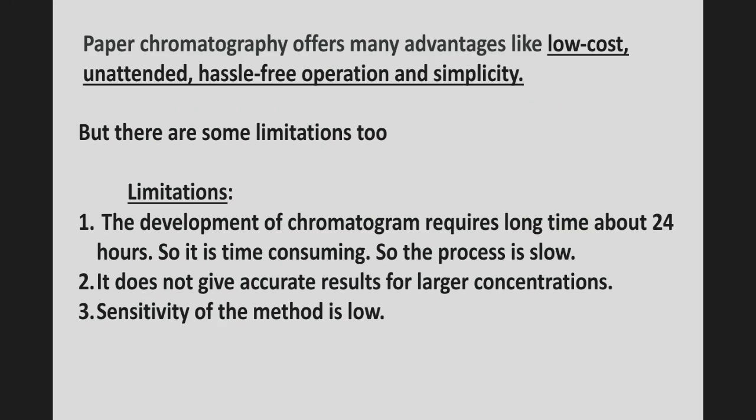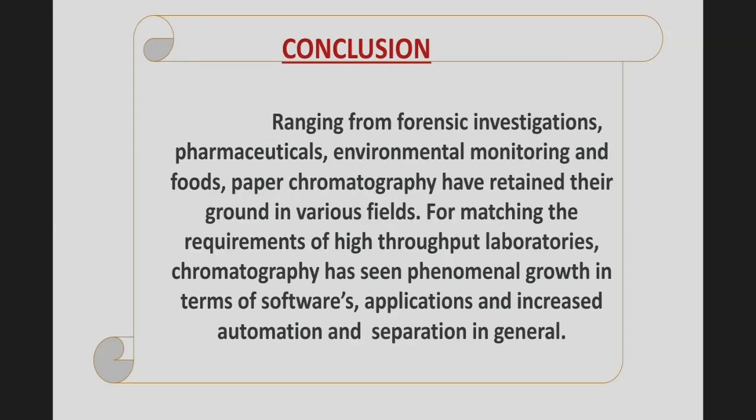Now, paper chromatography offers many advantages like low cost, unattended, hassle-free operation and simplicity. But there are some limitations too. First limitation, the development of the chromatogram requires a long time, about 24 hours. So it is time consuming and the process is slow. Then it does not give accurate results for larger concentrations. Sensitivity of the method is low.